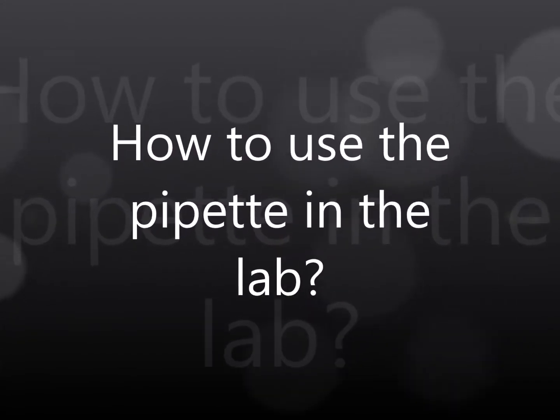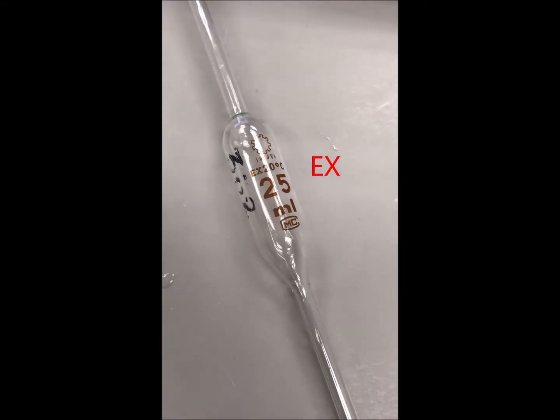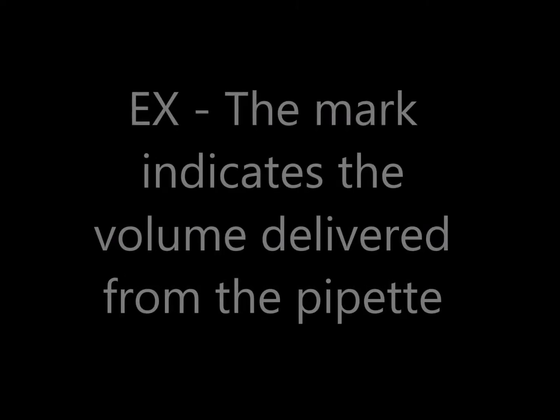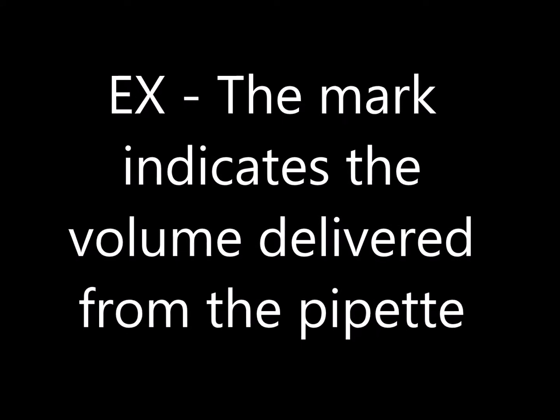First, check the type of pipette. Most of the pipettes used in our lab are EX type. This means the mark of the pipette indicates the volume delivered from the pipette.